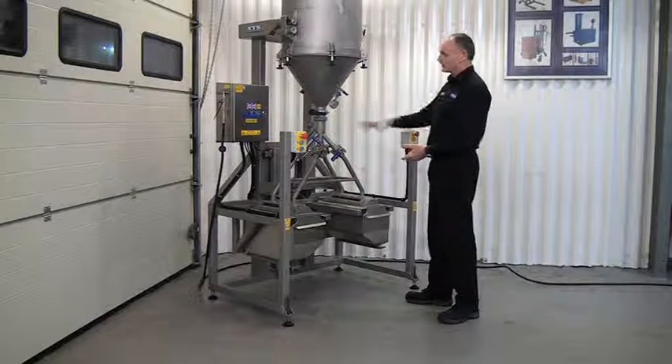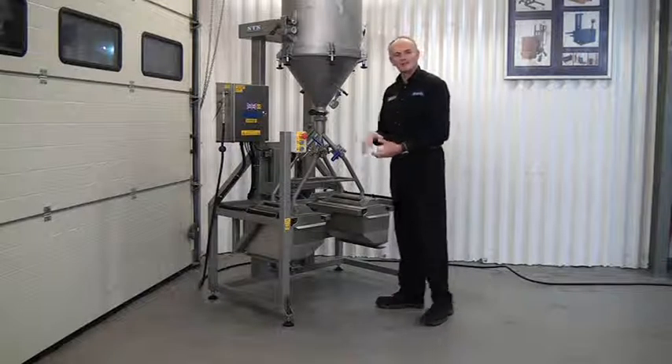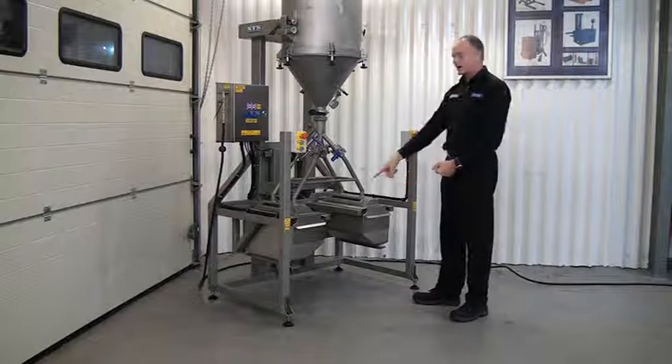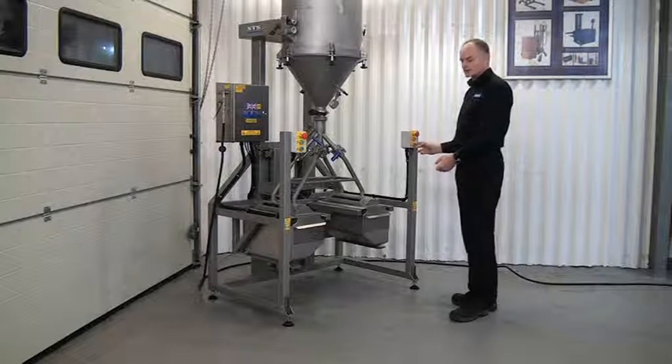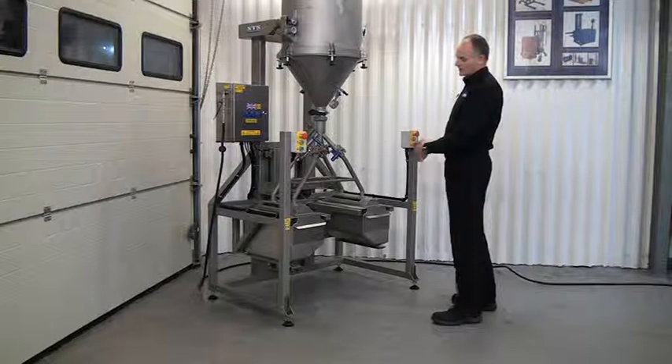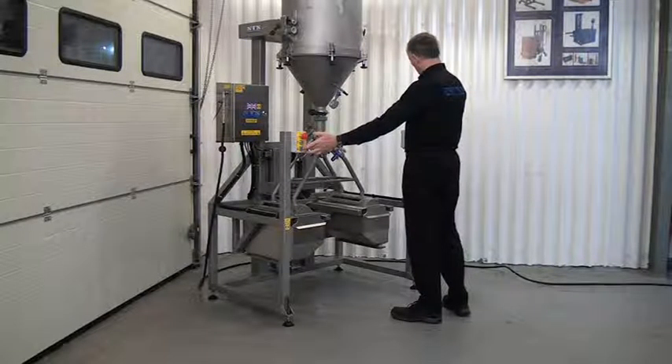We've transferred the powder, we've closed all our valves, and now we want to separate the system so we can take out the full hoppers. We do that by pressing the two blue buttons at the same time. Again, check no one's near the system before we operate it, then press the two blue buttons.